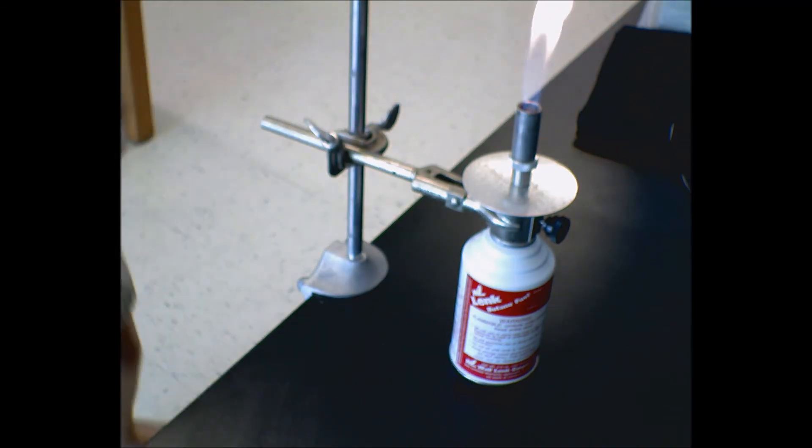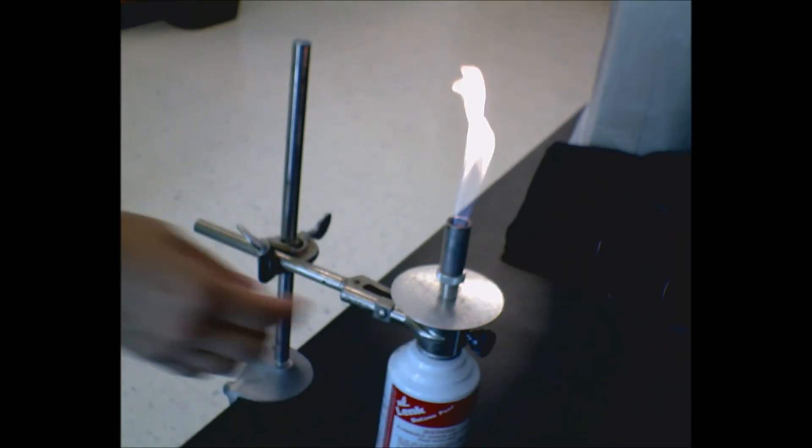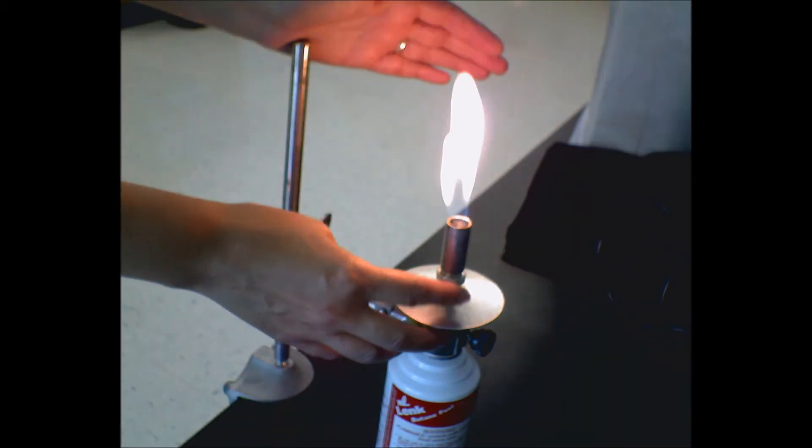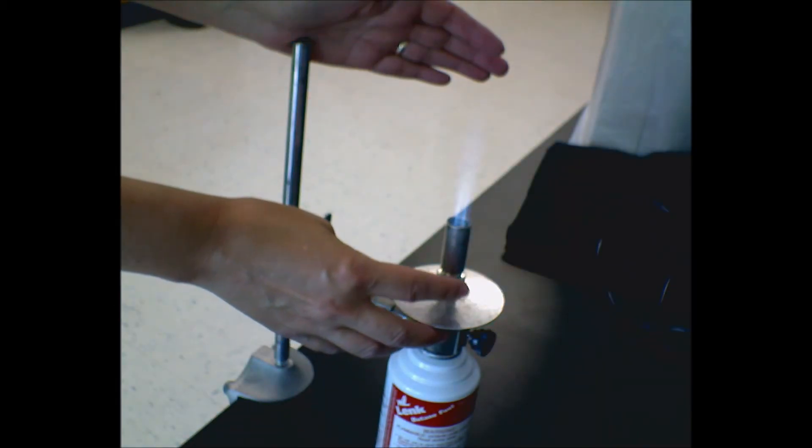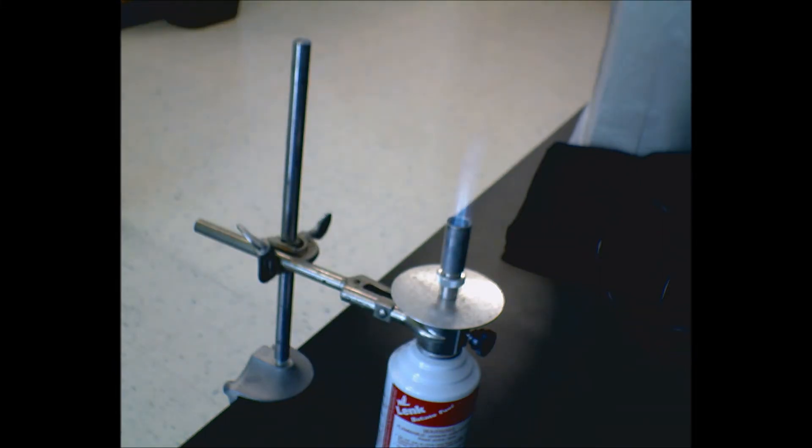You notice that's a very blue flame at the bottom but it's very yellow at the top. That's not an effective flame. So I'm going to roll this down, and all of a sudden it looks much less like a candle flame.